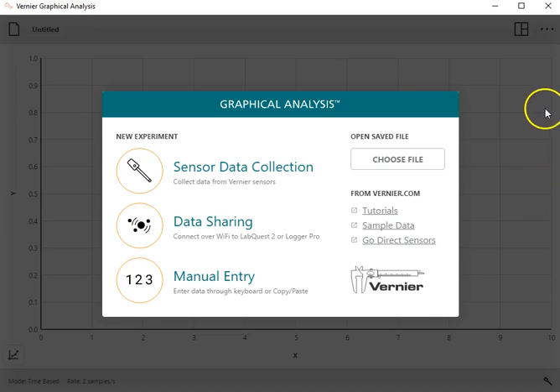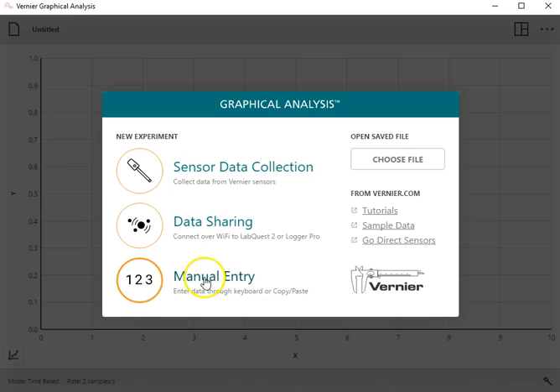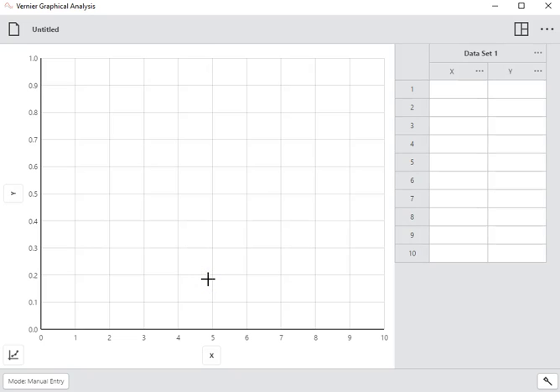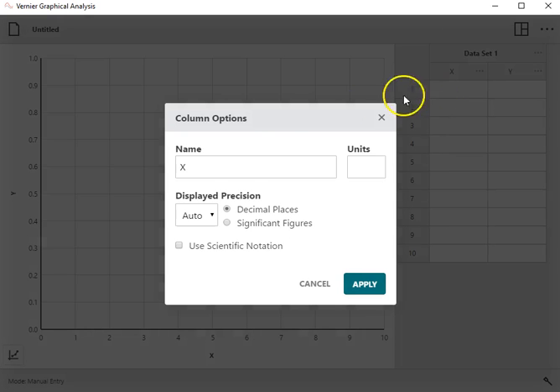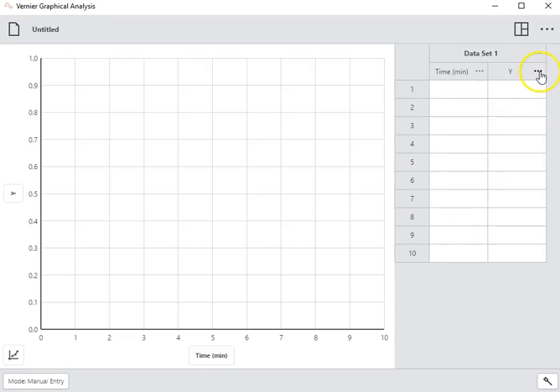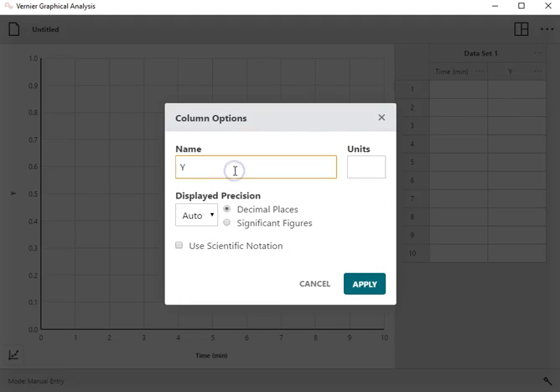This is the screen when you open up the Vernier Graphical Analysis. I'm going to click on manual entry, which opens up a data screen. To add data, I'm first going to click on my column options and name this column 'time' with units of minutes and click Apply. Then I'm going to do the same thing for the second column — go to column options and name it temperature.